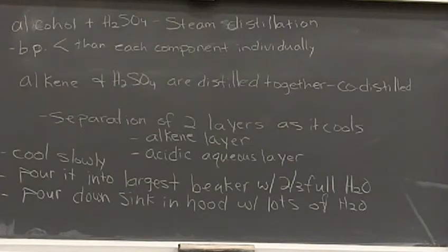So when you're done this week, you've got your alkene product. Make sure you get your yield, IR spectrum, GC sample of both 8 and 11 products, and you've taken care of your apparatus and getting everything cleaned up. Then just store that alkene product, and if you have a little bit of alcohol product, make sure you store that as well. Okay.